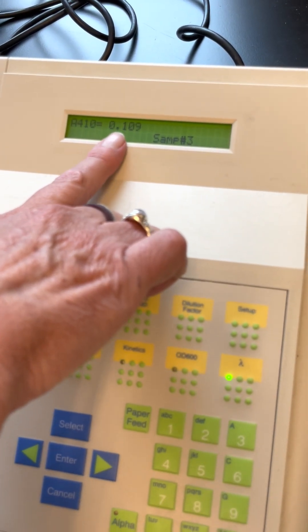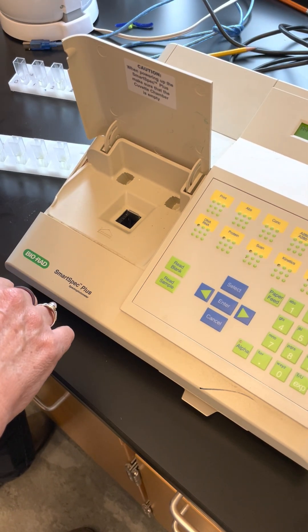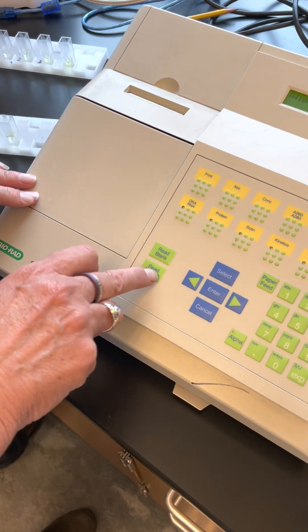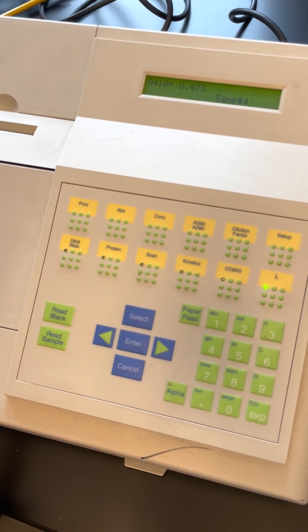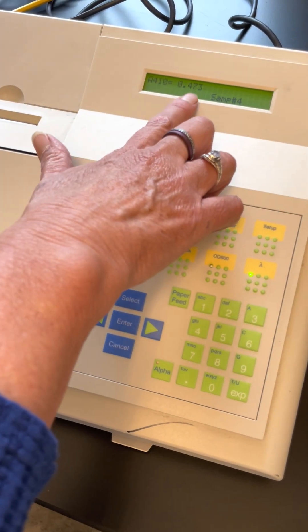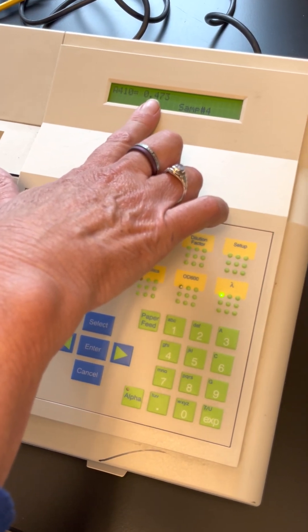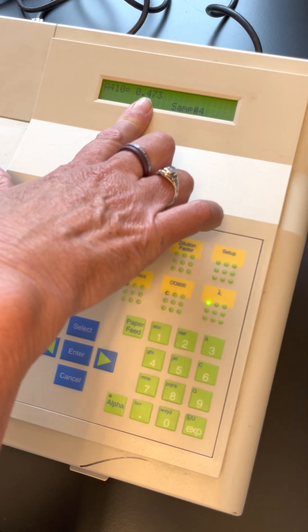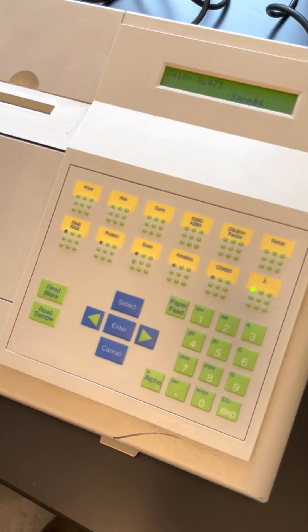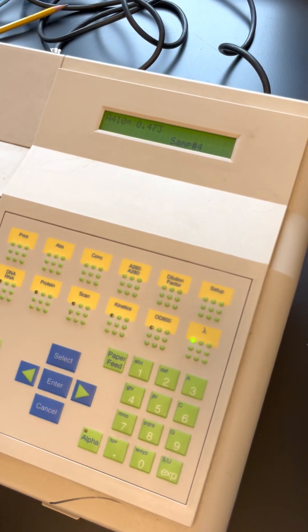Absorbance values between 0.1 and 1.5 are reasonable. My five-minute sample reads 0.473, which is fine. I could have probably extended my time intervals — instead of one, two, three, four, five minutes, maybe one, two, four, six, eight — because the final reading is not even half an OD. You can choose to do that when you run your own experiment.